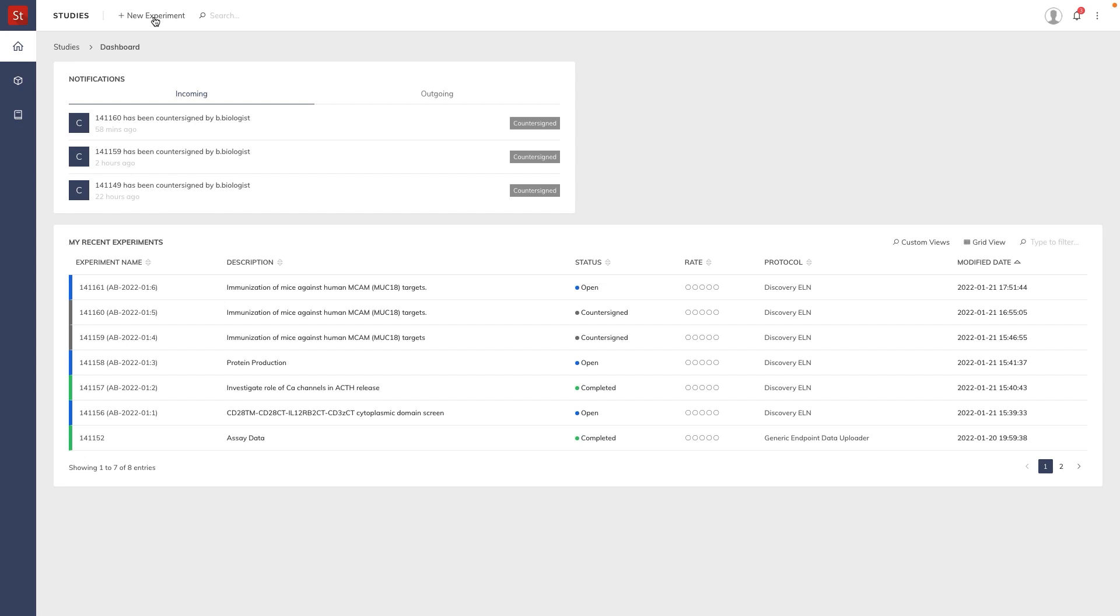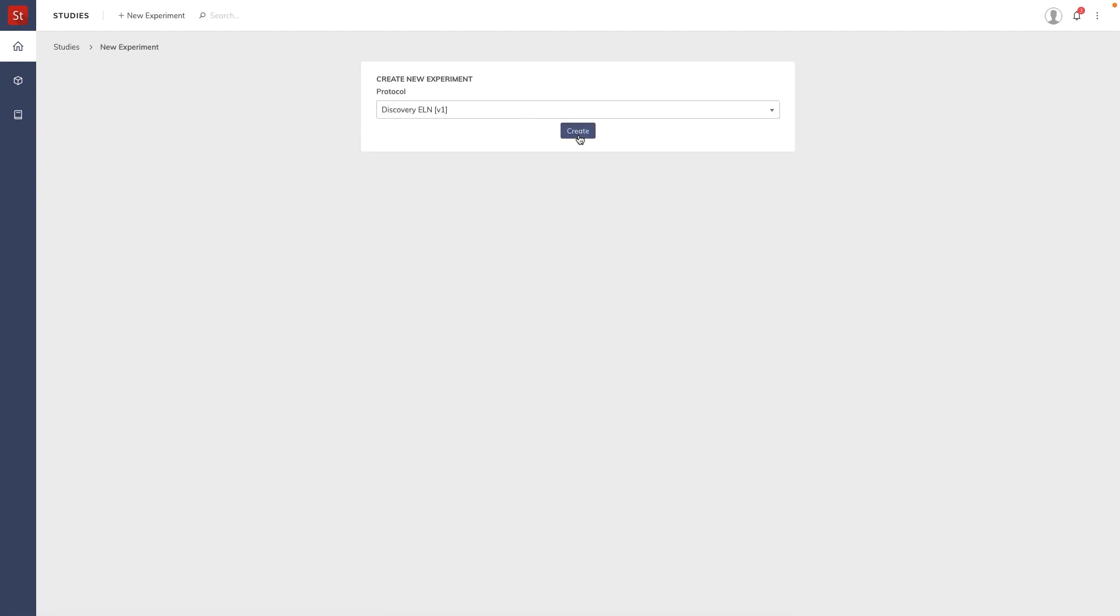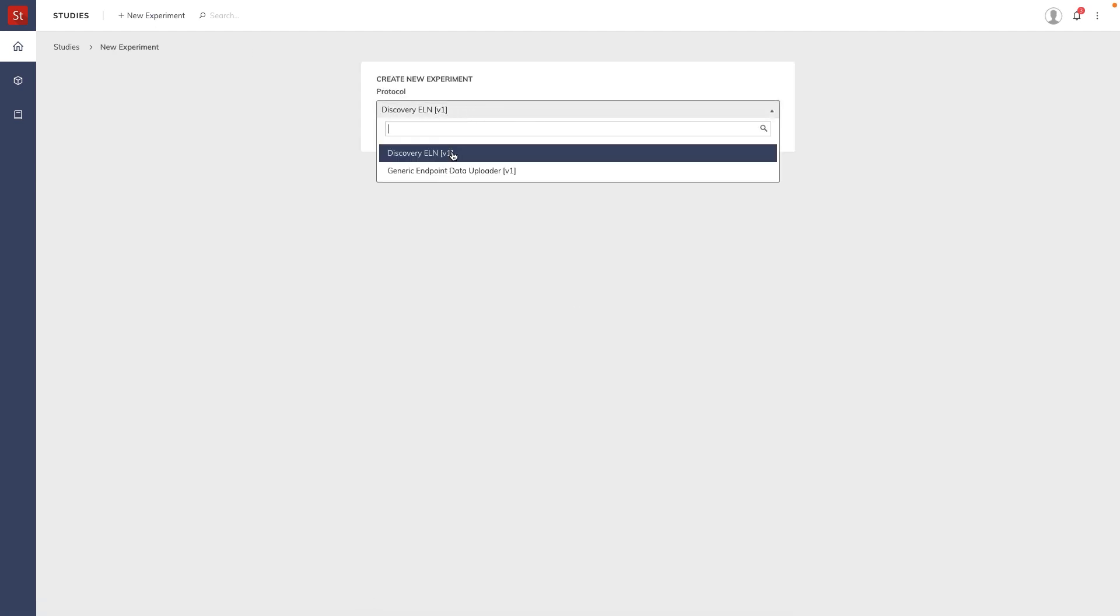The Excel file is not only loaded and saved in the ELN as is, but the data is also parsed directly into the experiment. So in this case I create a new experiment using a different template.